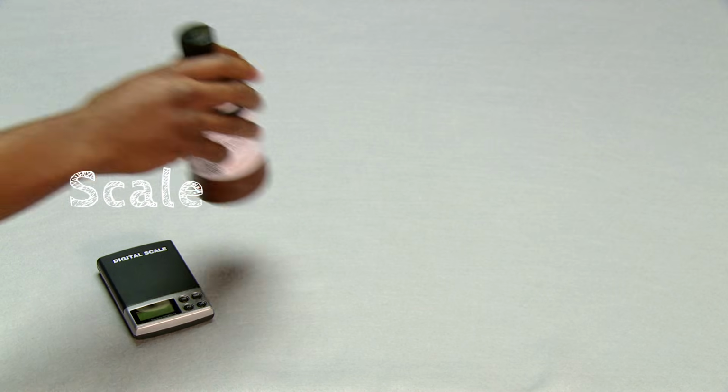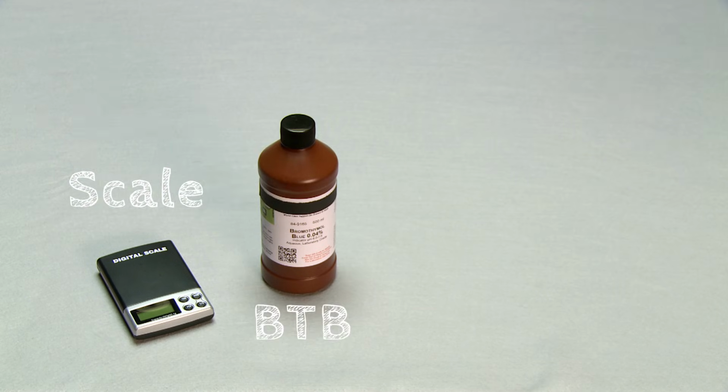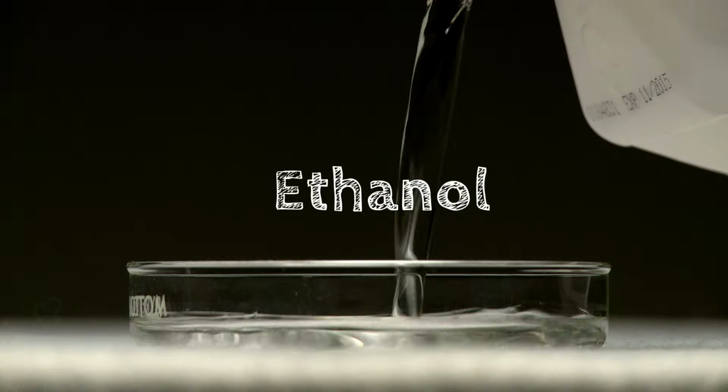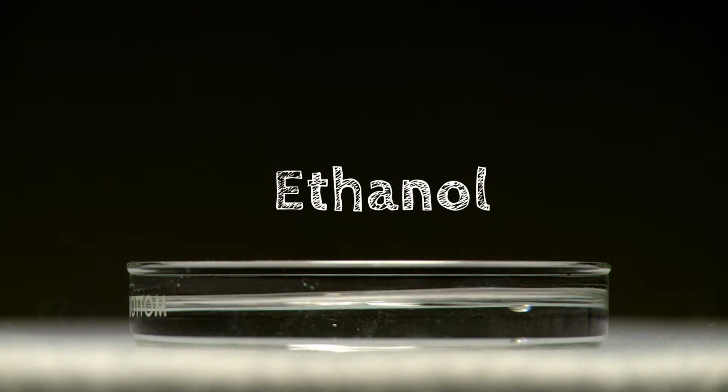Here's what we're working with: a scale that's accurate to 0.01 grams, BTB, a clear container to put over the burning ethanol, and finally, we've got ethanol to burn in a glass petri dish.